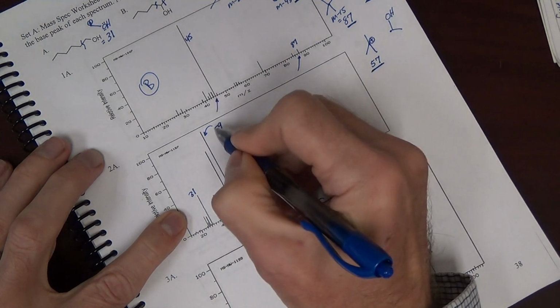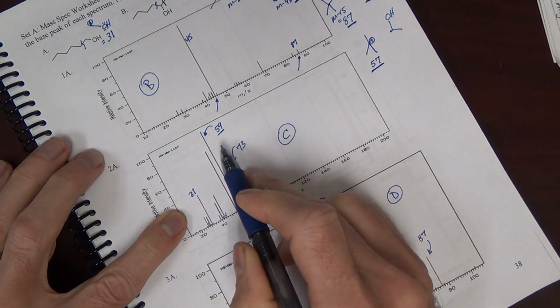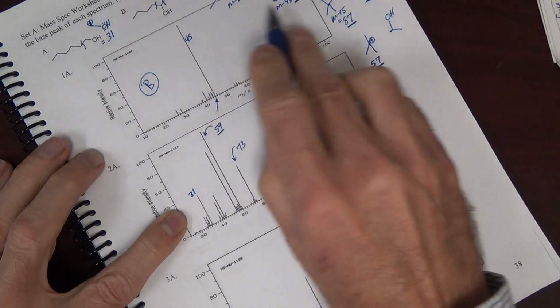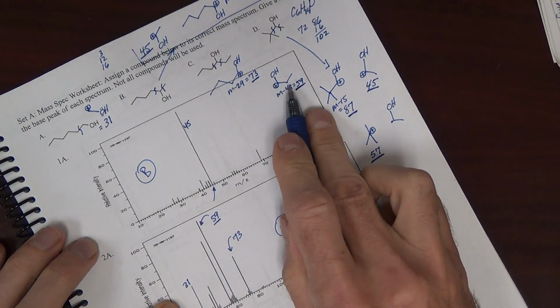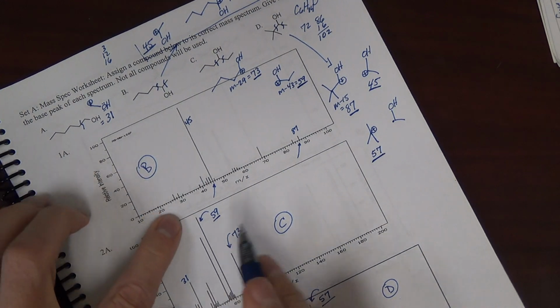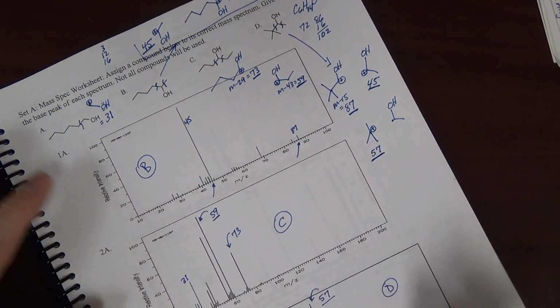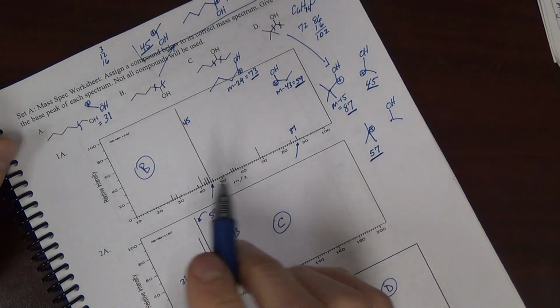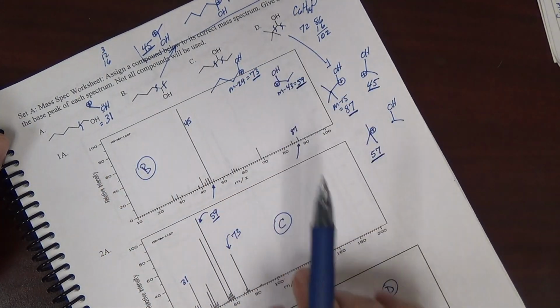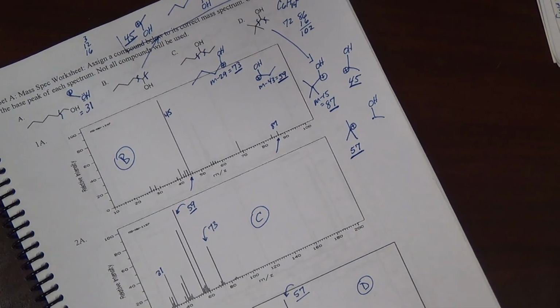We want to make sure that we're predicting a 59, and indeed we do with compound C. And in the first spectrum, 31 is quite small. So I'm pretty confident that we have B, C, and D assigned, and compound A is the fourth one that is not assigned.